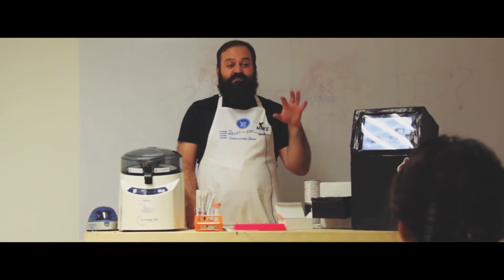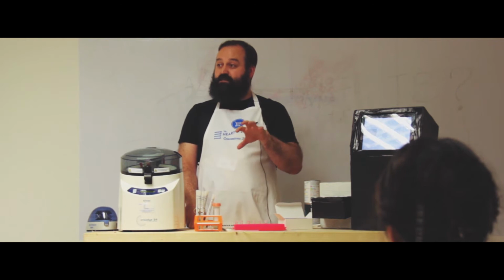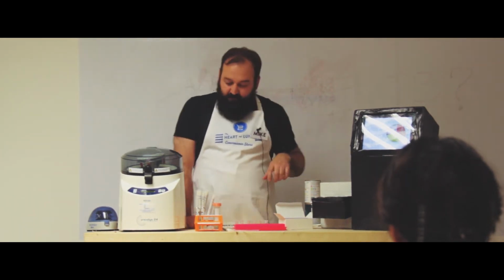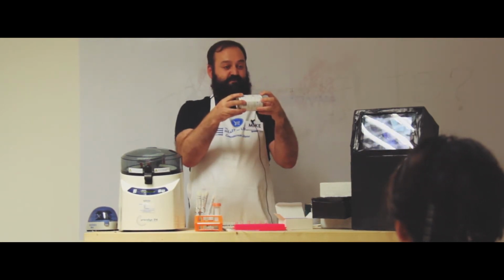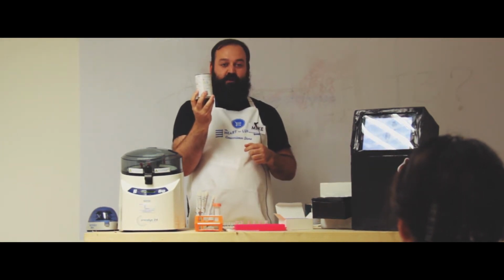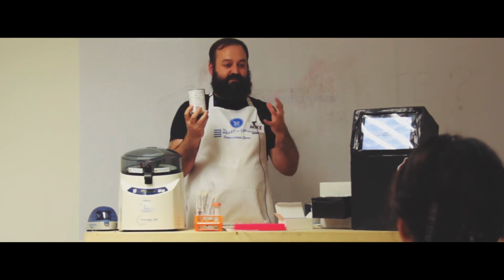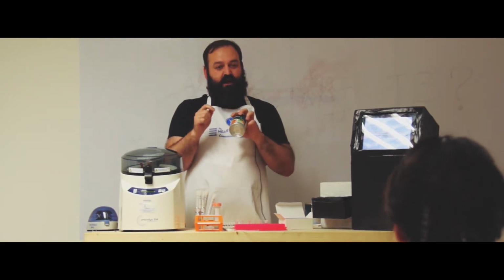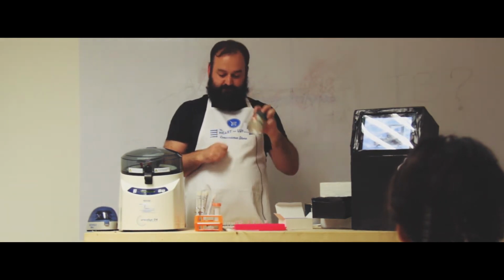So I'm going to show you how we take a sample and how we get the information about these bacteria, because they're too tiny to see and we can't grow them very well. So, first of all, this is my bacteria. I've got a tin of soup. What I'm going to use to tell these different bacteria apart is their DNA. It's the instructions inside the cell that tell that cell what it is. And bacteria have a tough outer shell, so the first thing we're going to have to do is crack that open.